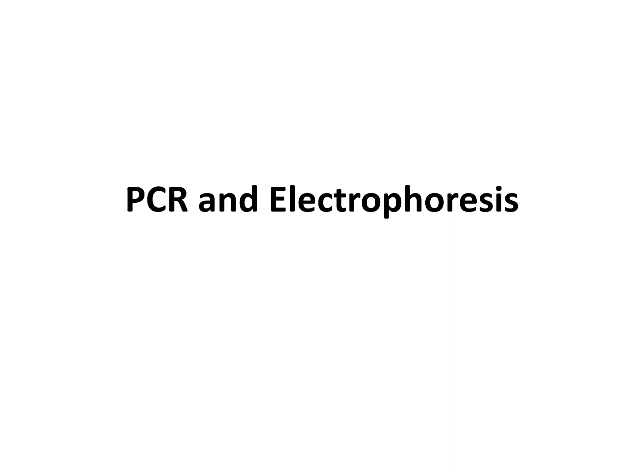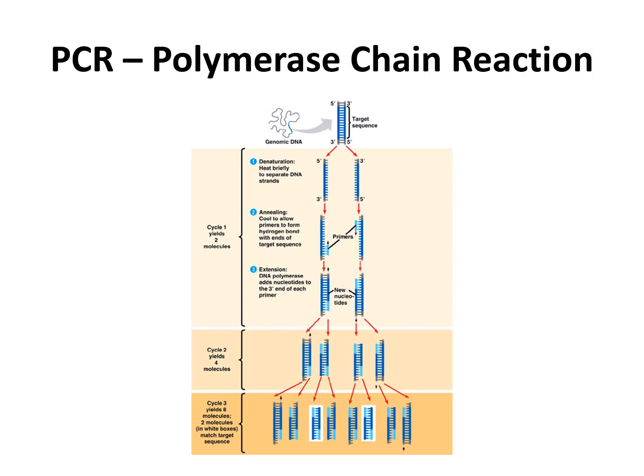The second part of the lab involves biotechniques such as PCR and electrophoresis. PCR stands for polymerase chain reaction, and this is a biotechnique used to copy DNA. So if you have one fragment of DNA, you can put that fragment of DNA through a PCR reaction, and as it goes through that PCR reaction, you will have identical copies made of that piece of DNA.